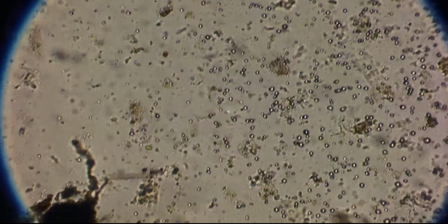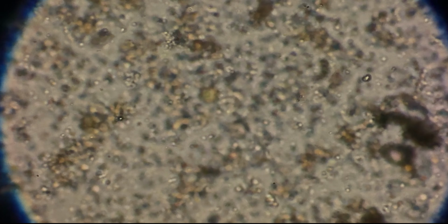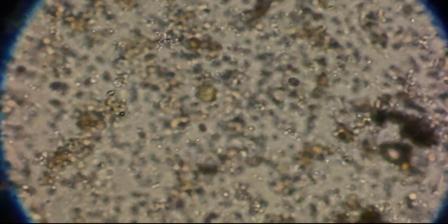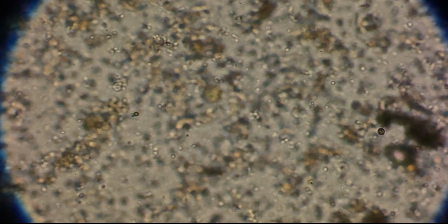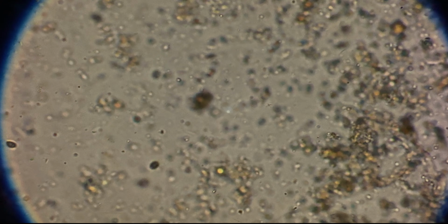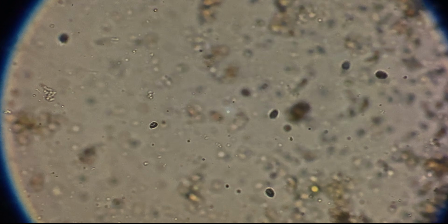Here's the thing about a microscope slide. It's not one uniform space. The kiwi juice doesn't hit every organism with the exact same force at the exact same time. Some organisms are closer to where the drop landed. Some are farther away, in water that hasn't fully mixed with the juice yet. So we're basically watching a wave of change roll across this tiny world in real time.